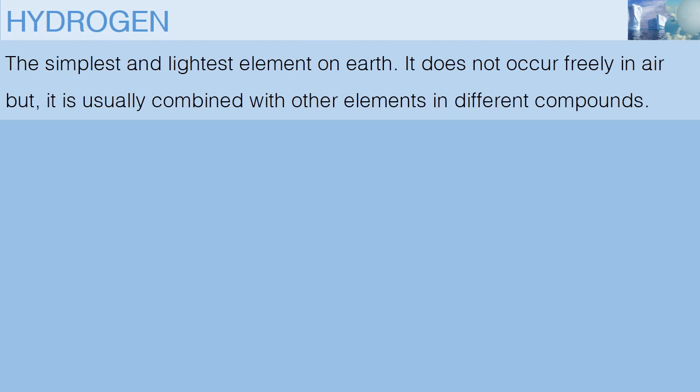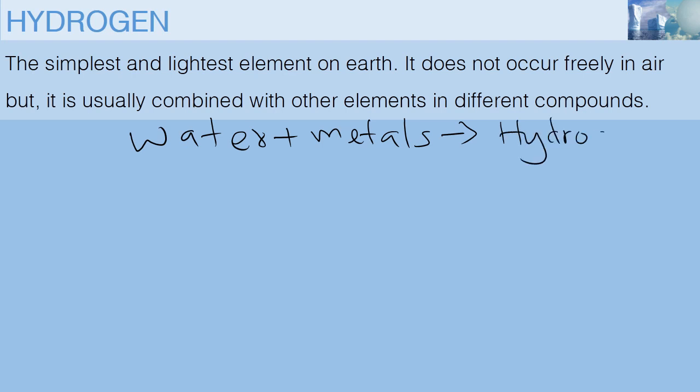From our previous experiments, we have learned that water reacts with metals to form hydrogen gas and some metal hydroxides.